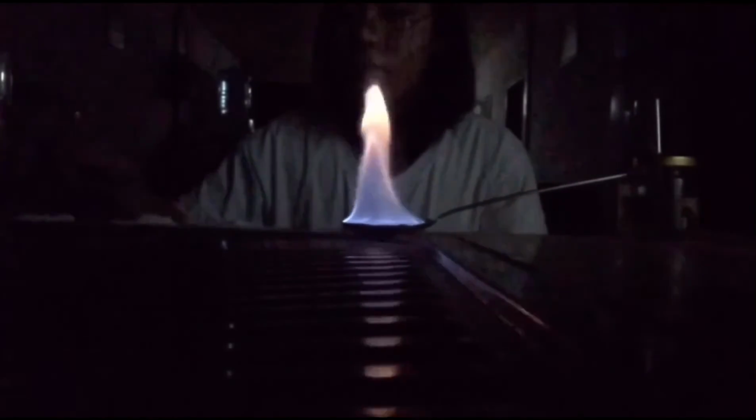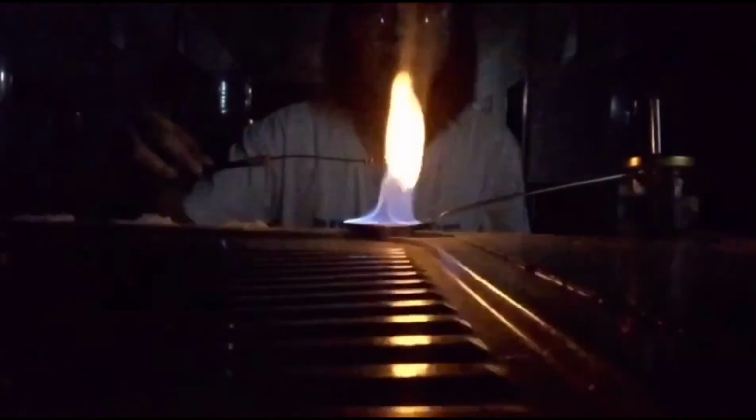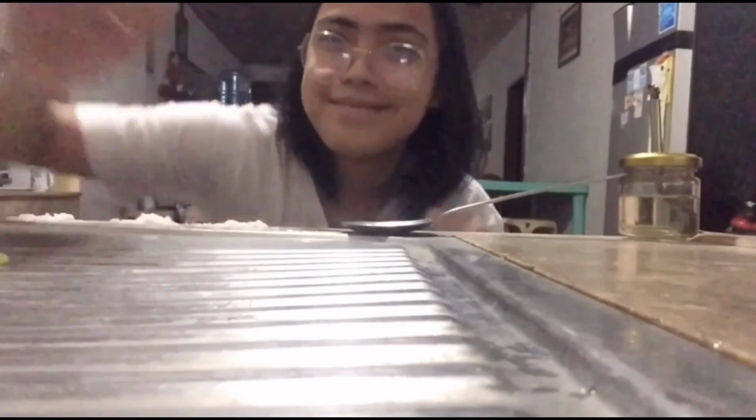So the last chloride that I tested is the sodium chloride or the salt. As you can see, the color of the flame is fully yellow. So that's it. Hope you guys can differentiate the different colors of the flame.